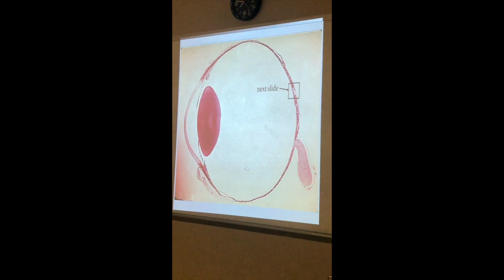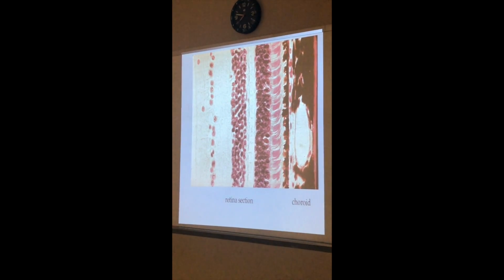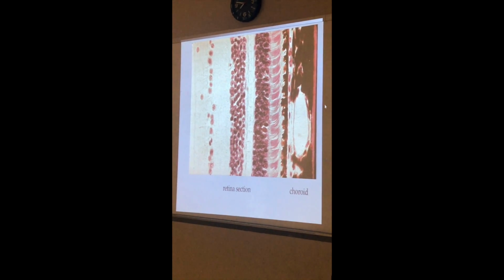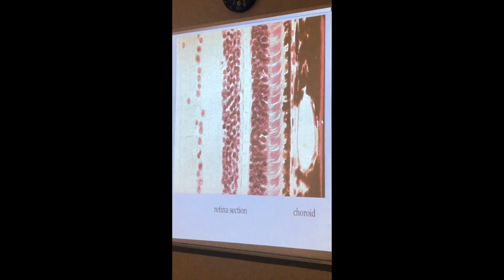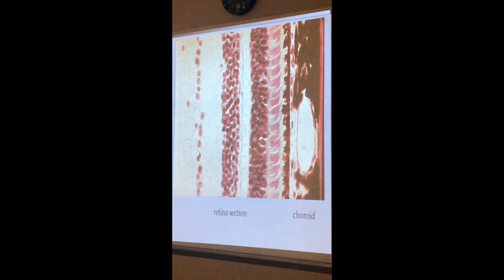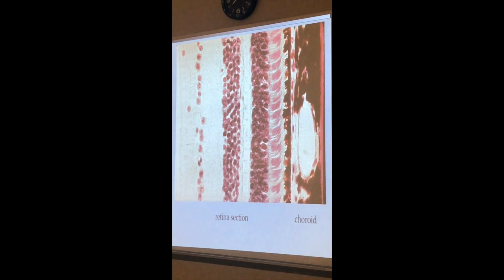Let's find out what that's all about. Okay. All right, got the pictures? So the light is coming in from the left and going in across here, going to the right. What do you think this pink stuff is over here? That's sclera. What is this black stuff over here? Is that the choroid? Choroid, and everything from this black layer on is retina.